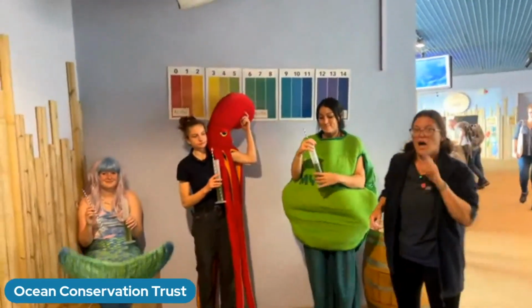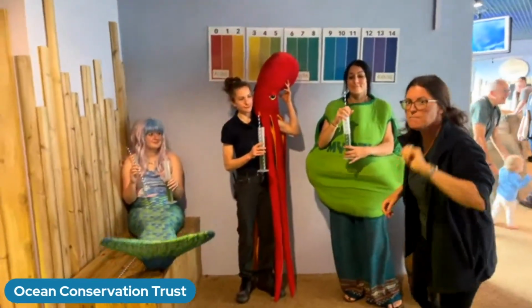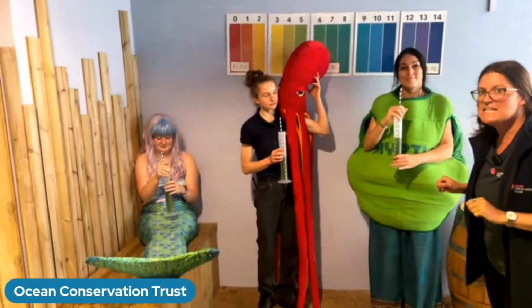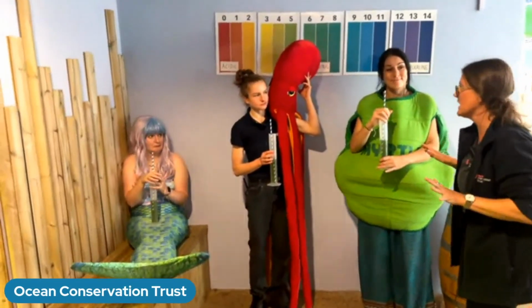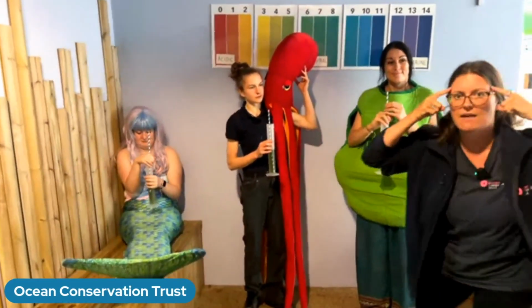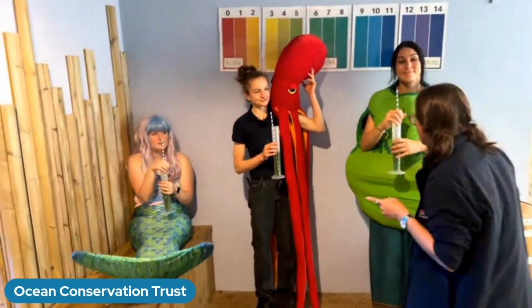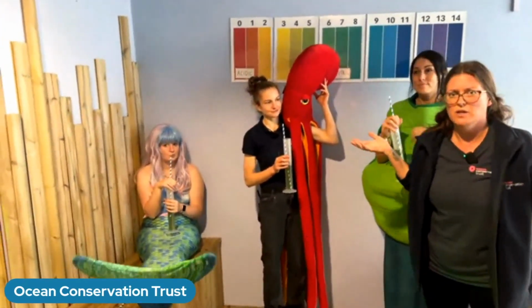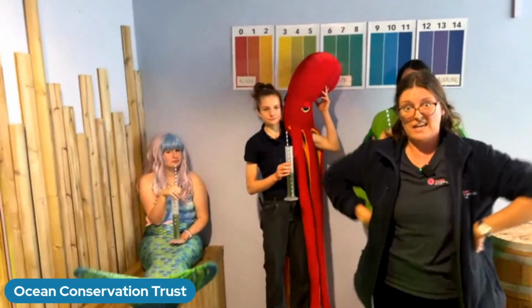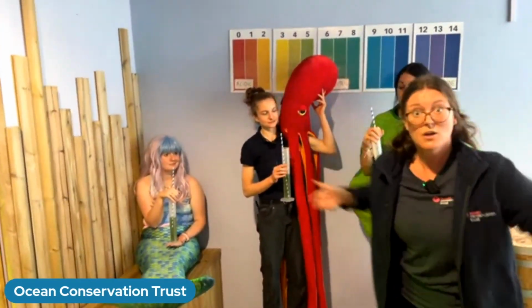Our gang here have got 30 seconds. They've got 30 seconds to blow as much carbon dioxide into their beakers as possible, and we will see who can change the pH level the most. Before they start, have a quick think. Have a little think, turn to your neighbour and think, which way is it going to go? Is it going to get more acidic? Is it going to get more alkaline? Is it just going to stay exactly the same? I don't know. We're going to find out.